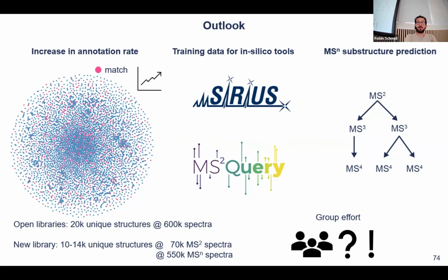Yeah, definitely. So if we put this in the public domain, people are going to get low confidence scores, and that's already something. I guess that's what you said. But still, it would be good to have some tags and some scores to give more evidence to it.